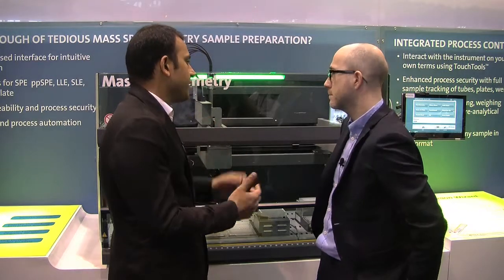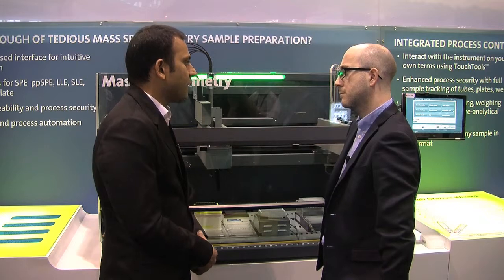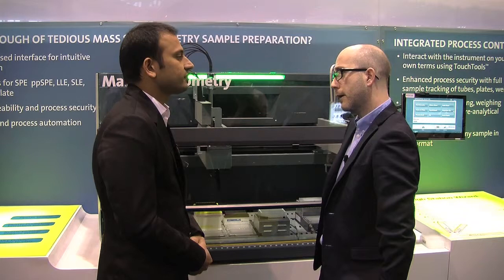What you're seeing here is a mass spectrometry sample preparation workstation. This is a single workstation that can accommodate a variety of sample preparation protocols that mass spectrometry laboratories typically use. Okay, excellent.